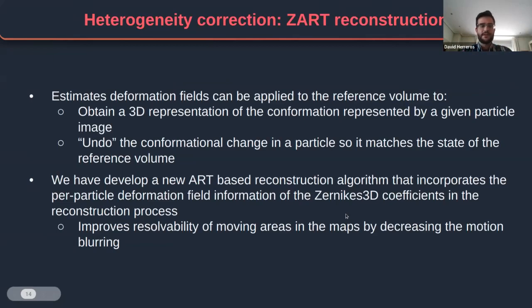And this actually makes a lot of sense, because if you are able to do that, you can get a new set of images, as many images as you had at the beginning, but now all the conformations of those images are more consistent.